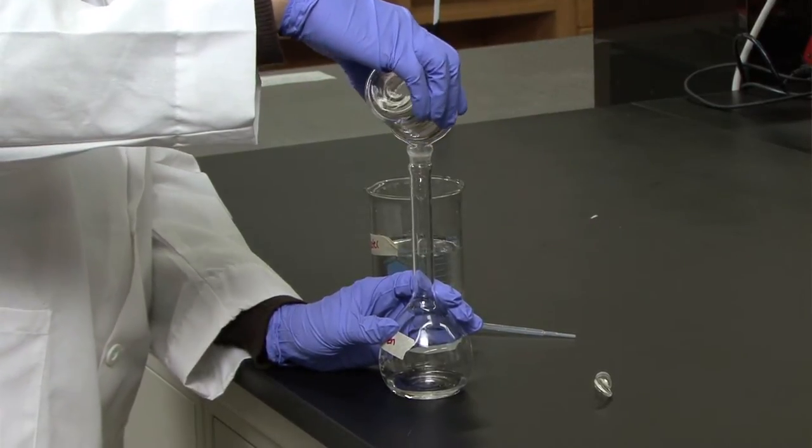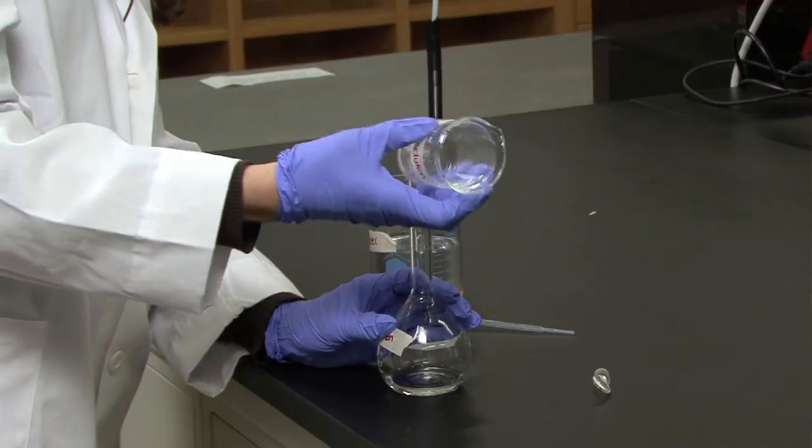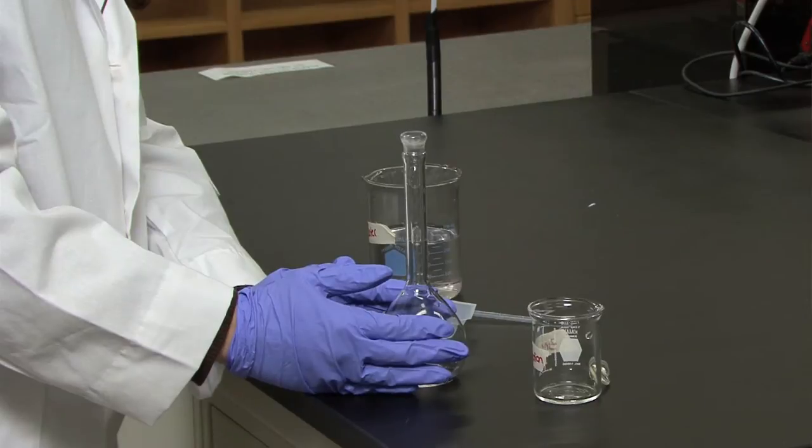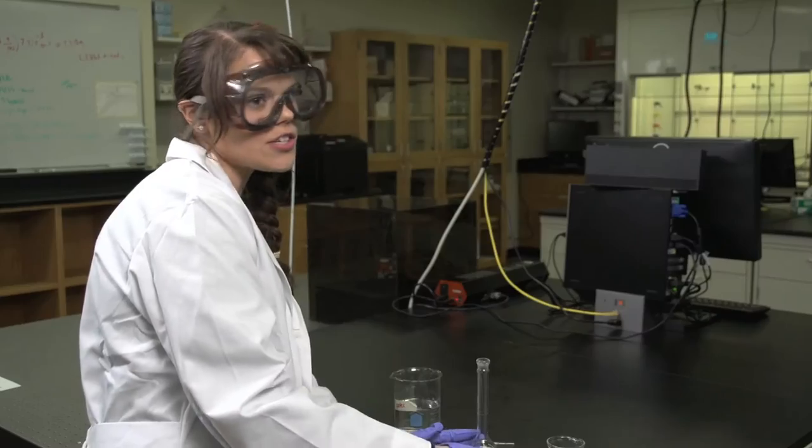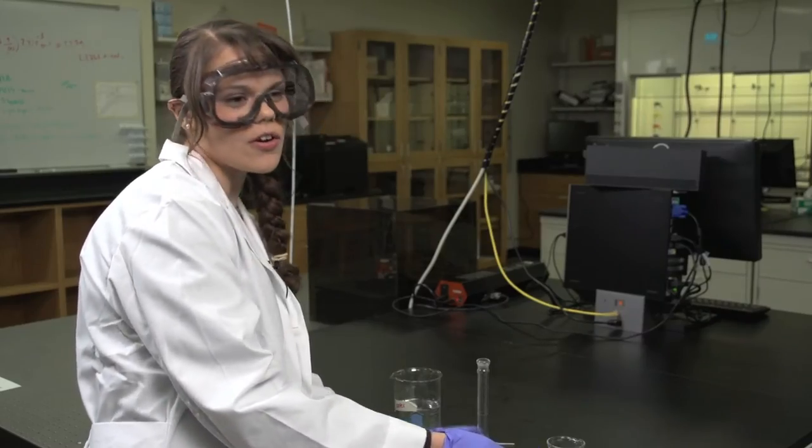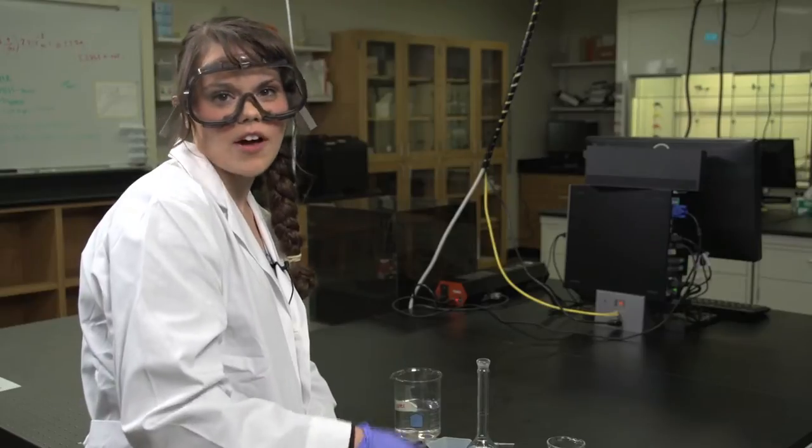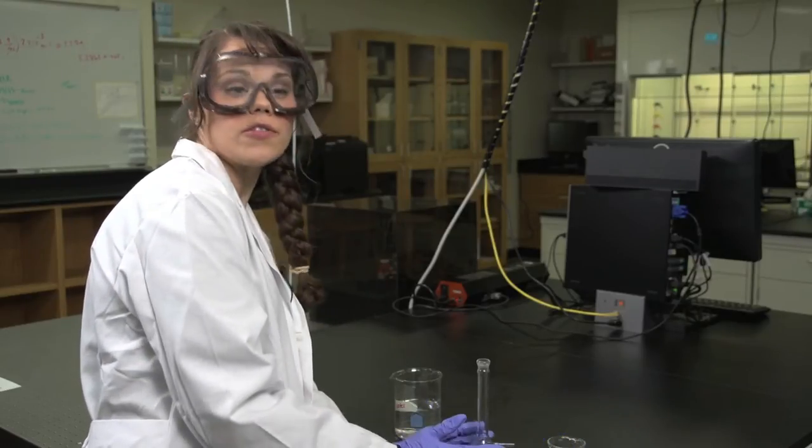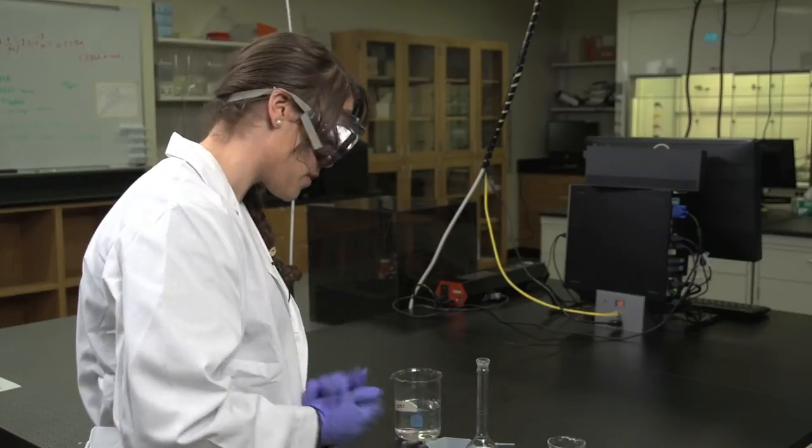It is important to note that when you are dissolving a metal, you have it completely dissolved before you put it into your volumetric flask. Also, if you need to use the sonicator or a hot plate to dissolve your solid, you need to make sure that your solution comes to room temperature before you fully dilute it to the appropriate volume.